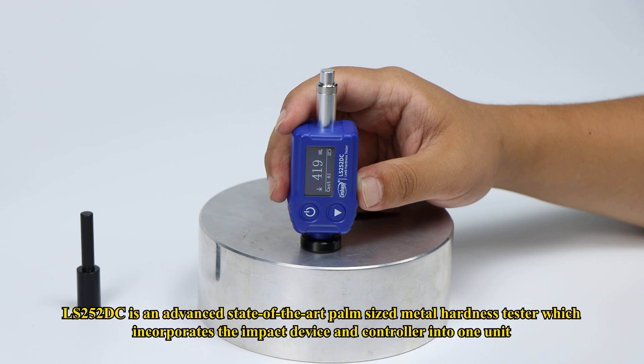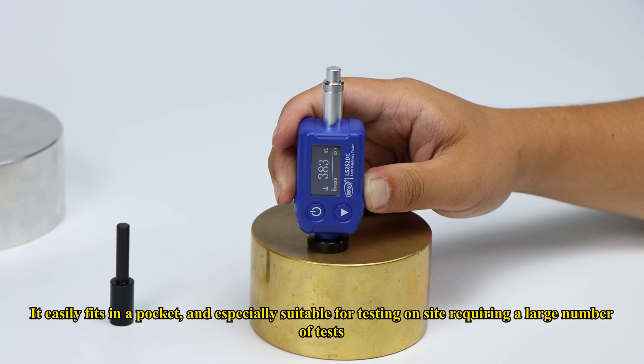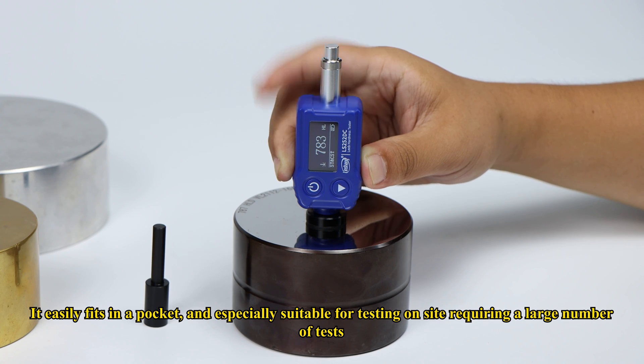LS252DC is an advanced state-of-the-art palm-sized metal hardness tester, which incorporates the impact device and controller into one unit. It easily fits in a pocket and is especially suitable for testing on-site requiring a large number of tests.